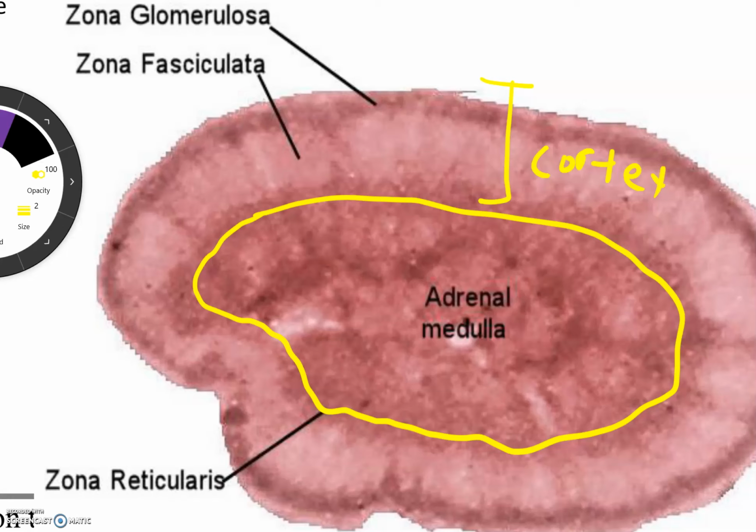So most of these other hormones we've talked about, in fact, all of them, are peptide hormones. These make steroid hormones, testosterone and estrogen, in this zona reticularis right here. The zona fasciculata makes cortisol, and then aldosterone is made in the zona glomerulosa. Now this picture is not a great picture. It's actually taken from a document camera to see the different areas of it.